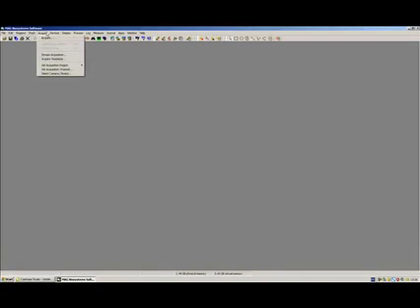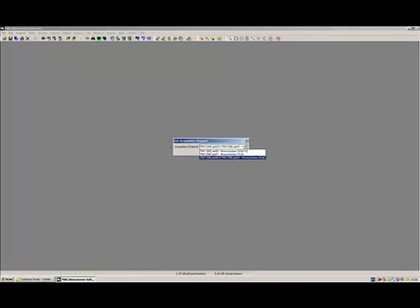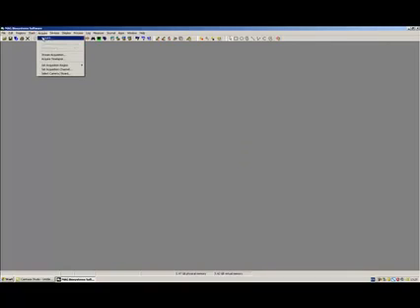Okay. The first thing to do is under the Acquire tab we have Set Acquisition Channel here, and we've obviously got the choice of our two cameras individually, or our third option down here is for using two cameras simultaneously. Now, if you have two different cameras, obviously you won't be able to do this. They have to be the same camera, same model for this to actually appear and for this to work.